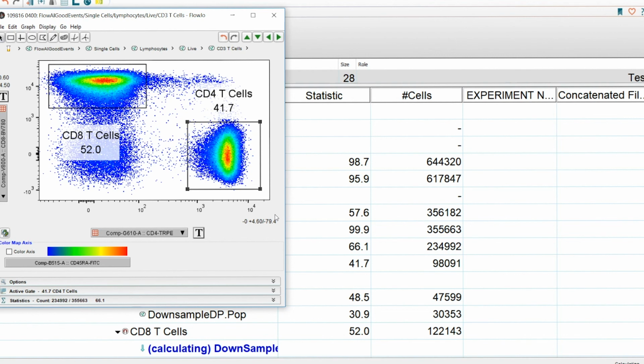A question that may arise in your mind is, am I changing the data? The answer is no. You're not at all modifying the data that was acquired. You are only changing its visualization and the amount of visual space. So you do not need to be concerned.